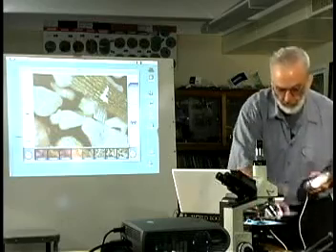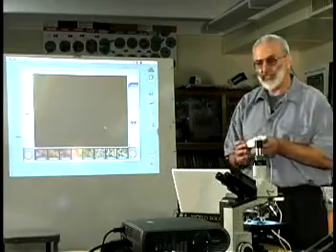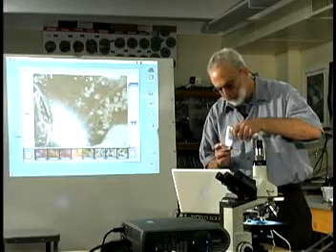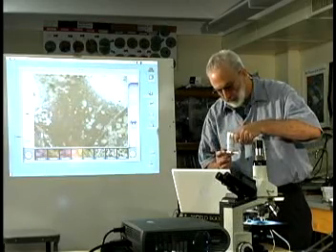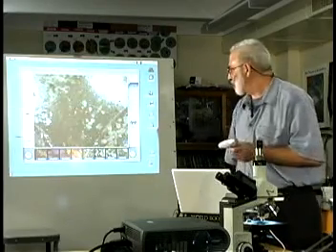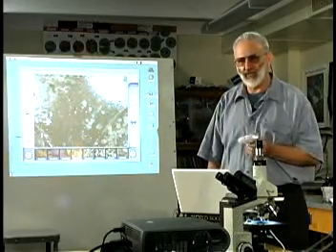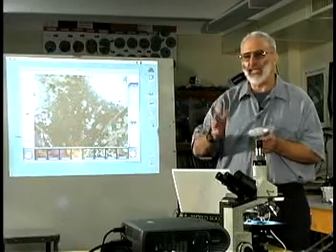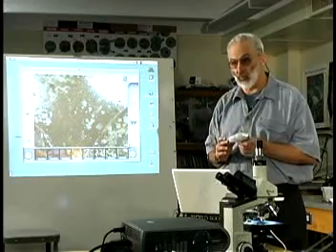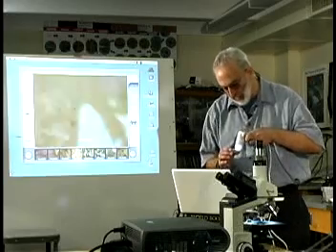The third sample we'll be looking at is a sample from Newport, California. This is in the Back Bay, so I'm going to take a couple of pictures. And our first picture, this is going to be interesting in comparison because what we're looking at is fragments, just little tiny pieces of dust. Okay? The Back Bay is further back inland, and therefore the wave action has to bring the sediment source in further.